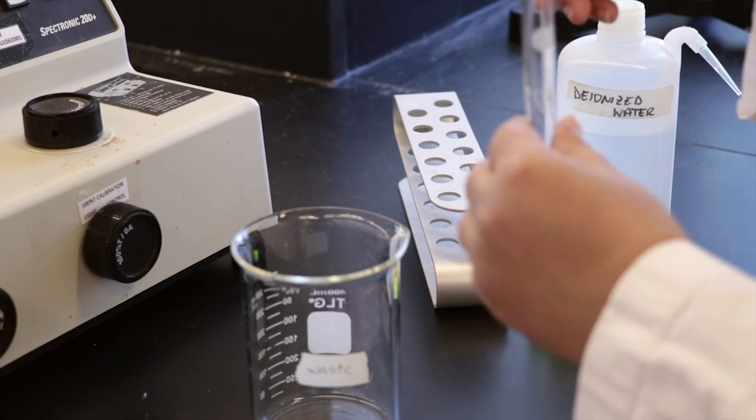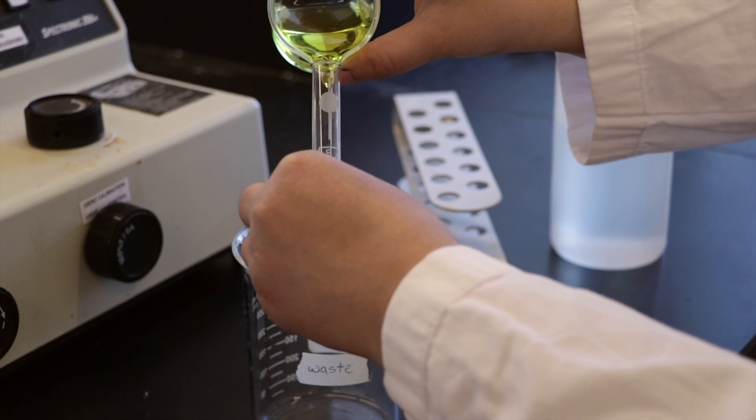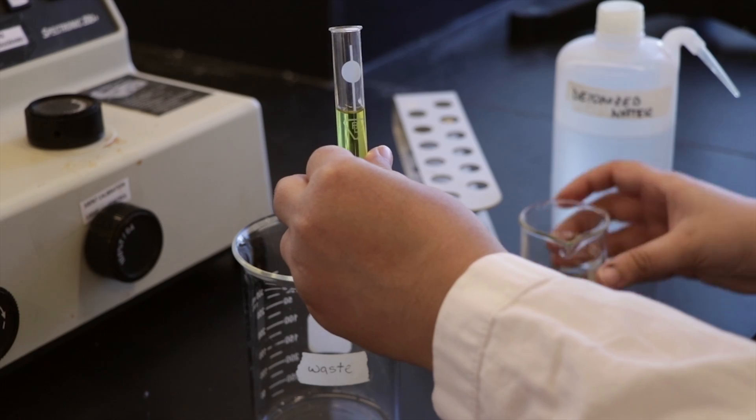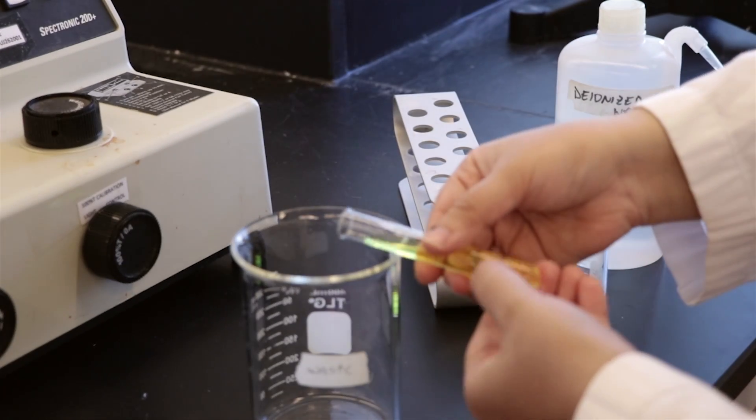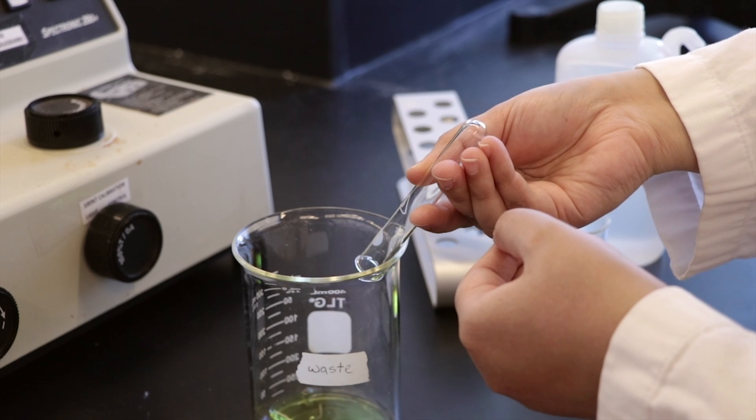You will use one cuvette for all readings to ensure consistency in path length. Rinse the cuvette three times with distilled water and three times with the next solution to be measured before each reading. Ensure that you're rinsing all sides of the cuvette as shown here.